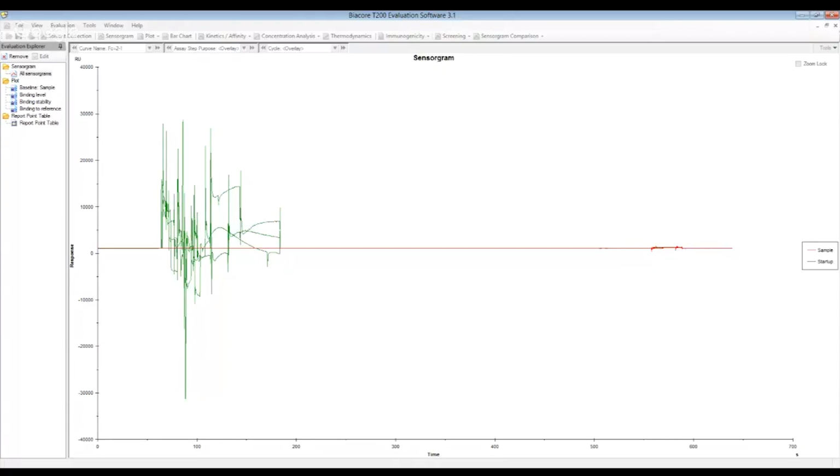So now we are going to... there's some technical glitch.